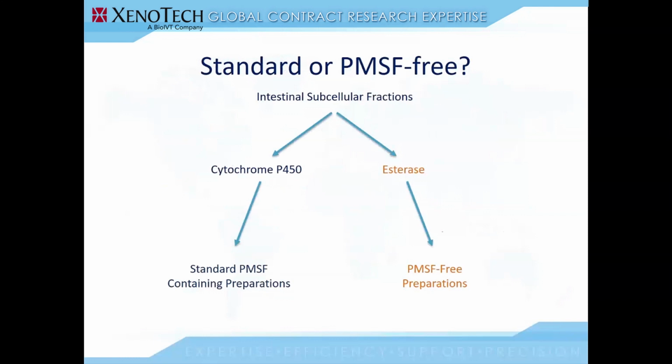I also want to point out that the intestinal subcell is the only tissue where protease inhibitors are used during production. No other subcell fraction from any other tissue is produced in the presence of protease inhibitors, so altered esterase activities in other subcell fractions are not a concern.